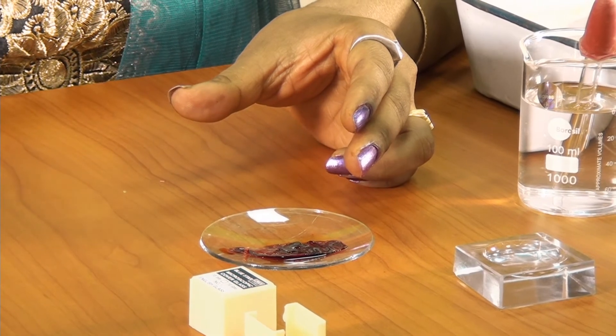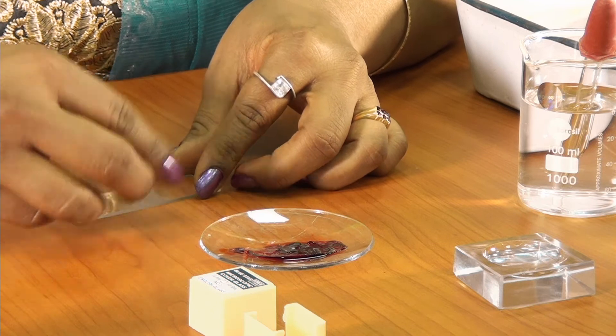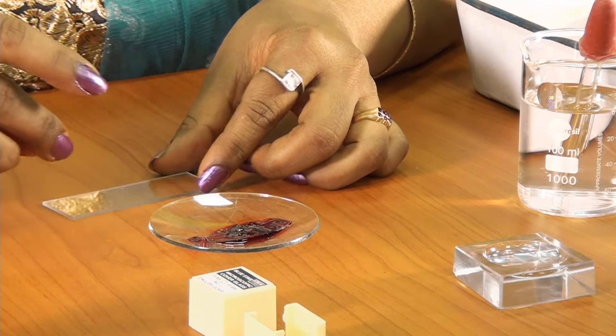By this time, the cells might have got stained properly. I am going to take a part of this peel over to the slide.